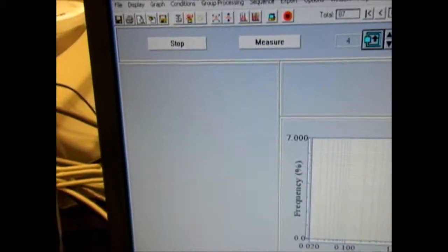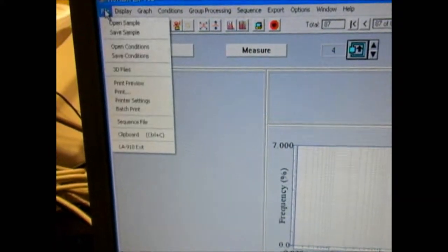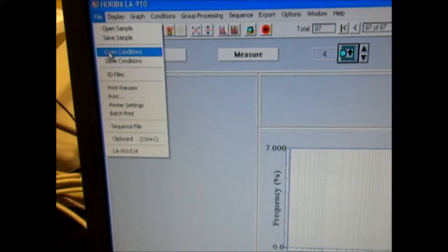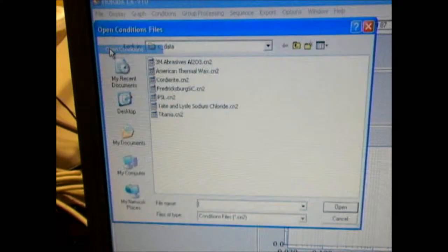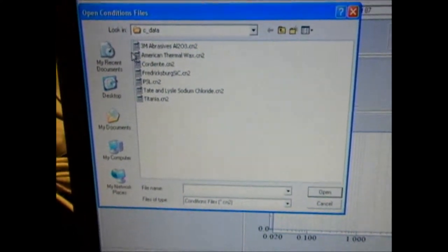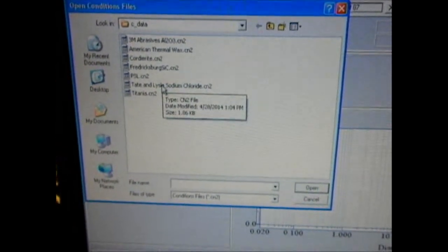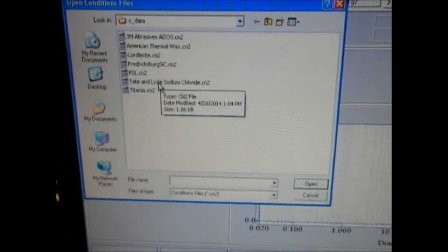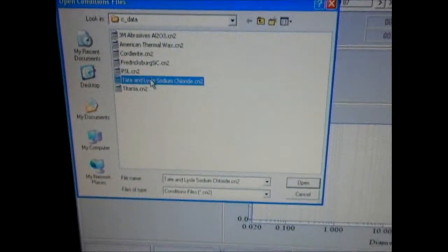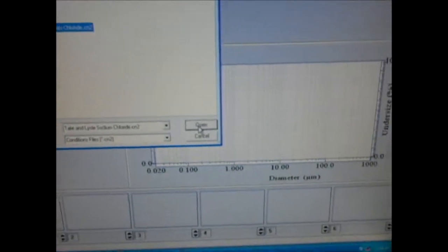To load a condition file, move the cursor under File, go to Open Conditions, and look for the file of interest. Today we would like to do some analysis on sodium chloride, so I'm going to click on sodium chloride and then click Open.